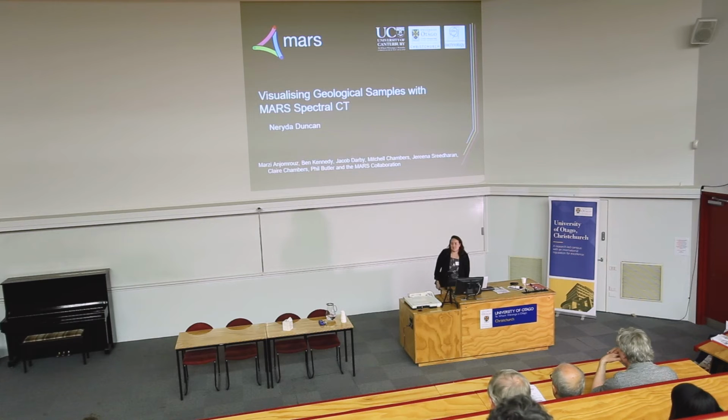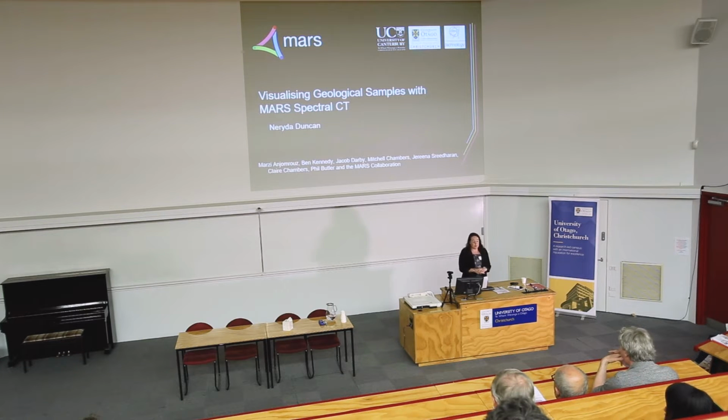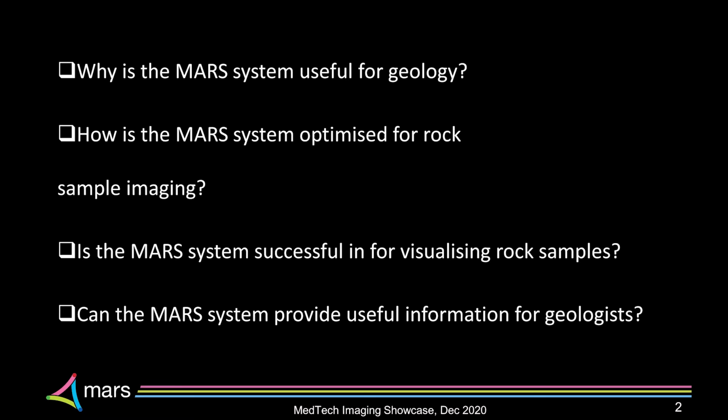Kia ora koutou everyone. So as Stephen introduced, I'm Neryda, and I'm going to further introduce the versatility of the Mars scanner by looking at scanning geological samples with Mars spectral CT.